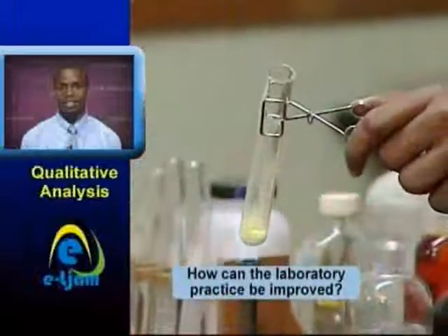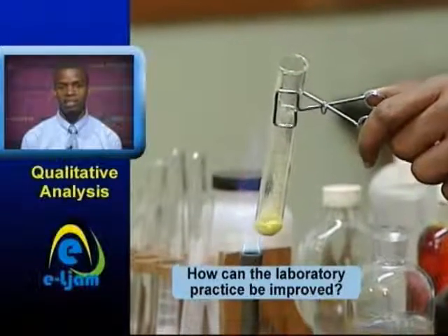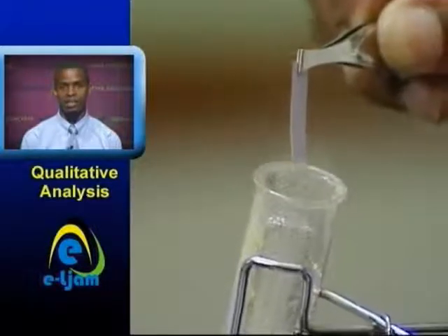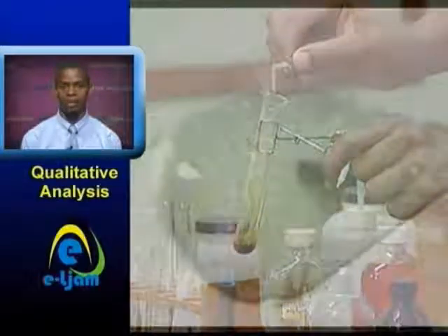The solid is to be heated gently at first, then strongly, until no further change is observed. The effects of the heat and the appearance of the residue after heating are to be noted. All escaping gases are to be tested.